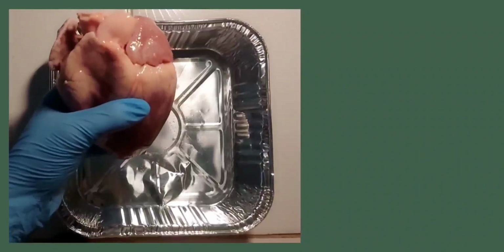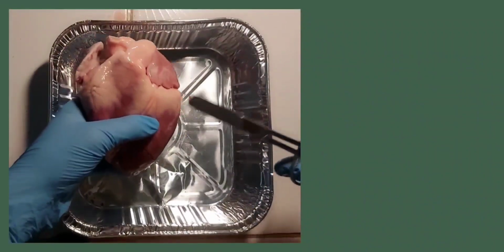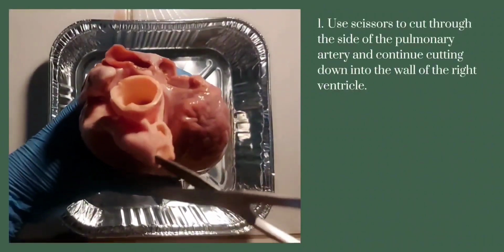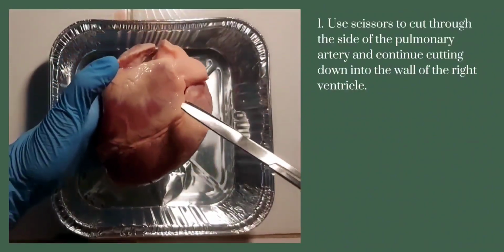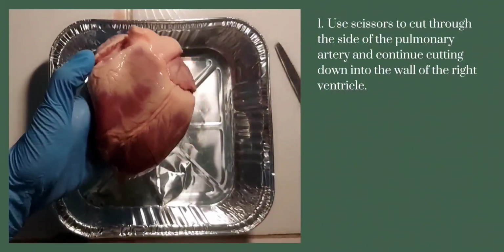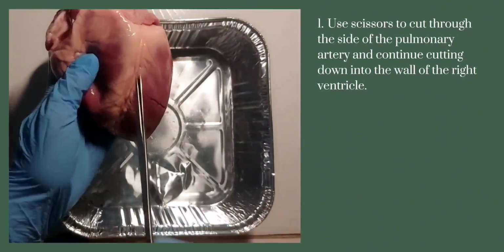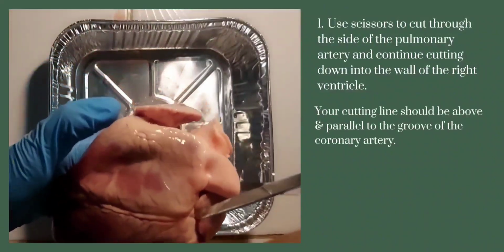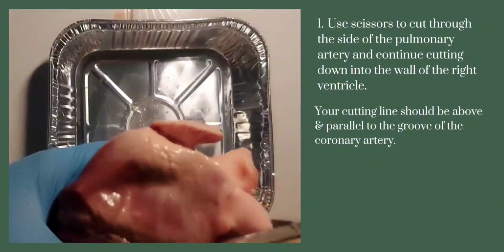Now that we are done with the external structure, let us locate the parts of the internal heart. The first step, use the scissors to cut through the side of the pulmonary artery and continue cutting down into the wall of the right ventricle. Be careful to just cut deep enough to go through the wall of the heart chamber. Your cutting line should be above and parallel to the groove of the coronary artery.